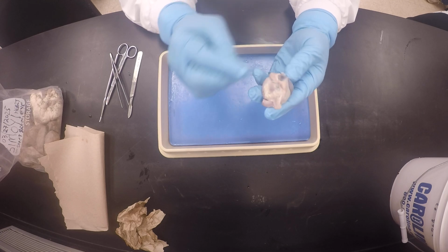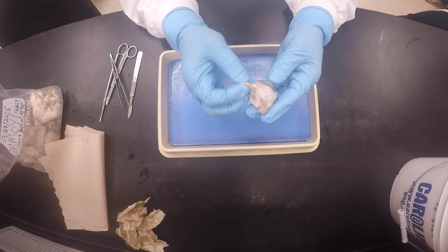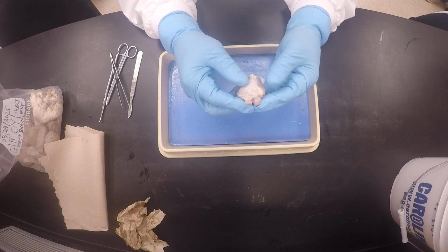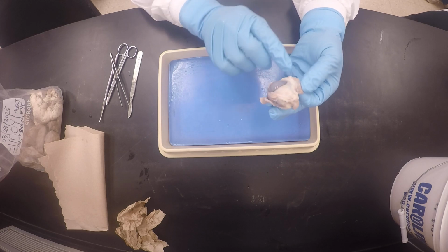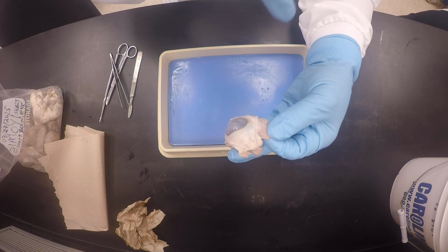And so this short side here looks like it's only got that, right? So we immediately know that this is the medial side, right? The medial side will only have one at the compass point. In this one, you can see how it's got the rectus on the compass point, and then part of the oblique got nicked, but you see this part here? Do you see, my good friend? Yeah, it's on.